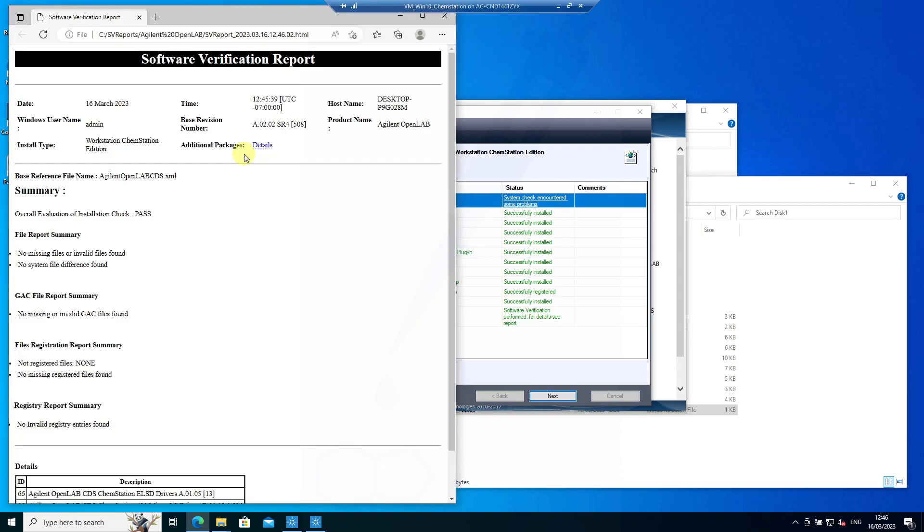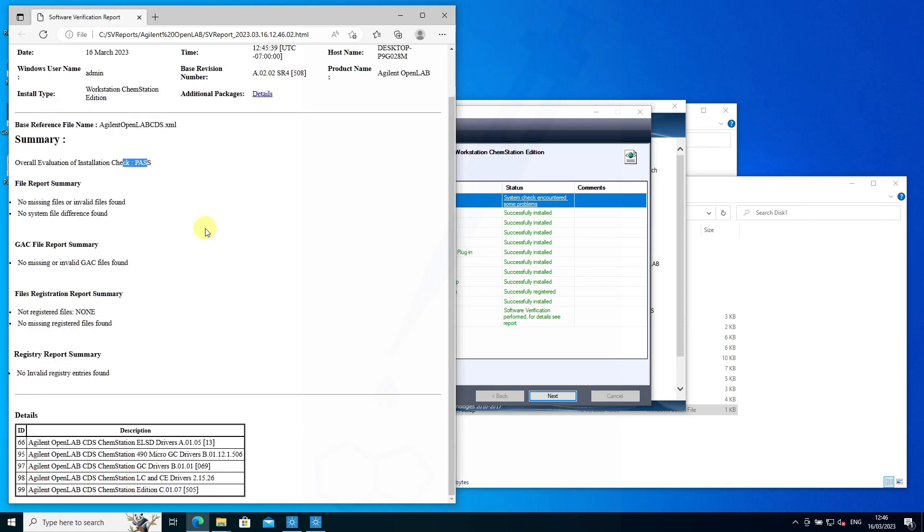The final report might look like this, where the software verification is run. The overall evaluation might be a pass or fail, and you can see what was installed in terms of the drivers—the GC and LC drivers—as well as the version.